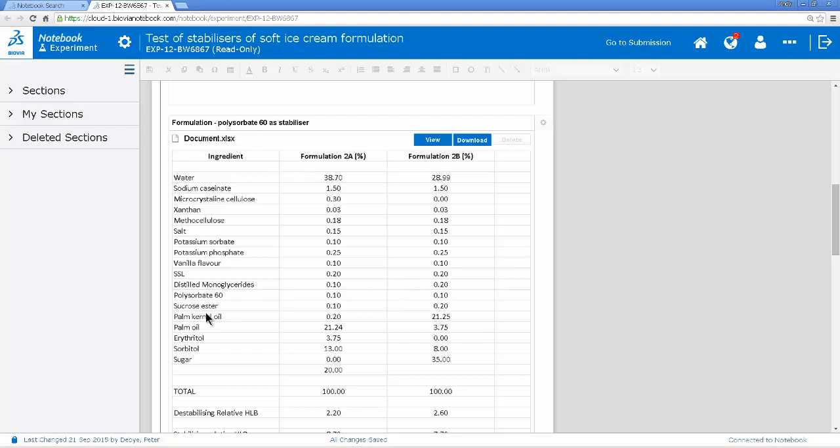Now I could just clone this whole experiment, create a new experiment that's a copy of this experiment and then just modify things. But actually I don't need the whole experiment. This experiment is mainly to do with stabilizers which is not what my experiment will be. So I'm just going to take this whole section and copy it and put it into the experiment that I'm working on.